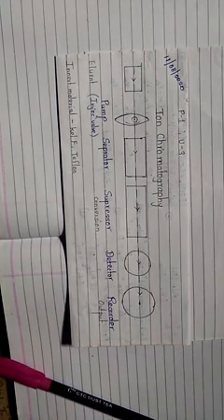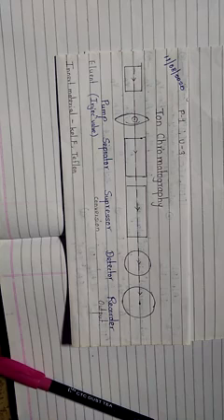First we introduce this ion chromatography. The principal reason for this technique is speed of analysis. One can easily perform separation in a few minutes, and this speed or rapidity of separation may be attributed to efficient detectors which are available in both systems.